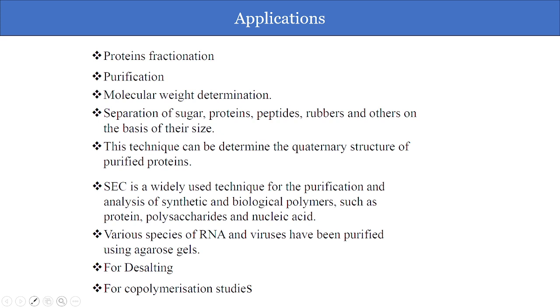You will see a very vast shift, equal to the total of the two proteins. So the molecular weight will be higher, and it will elute at a much lower elution volume. That shows that the two proteins interact very well. This can happen even if your protein has the tendency of oligomerization, then the same thing happens.